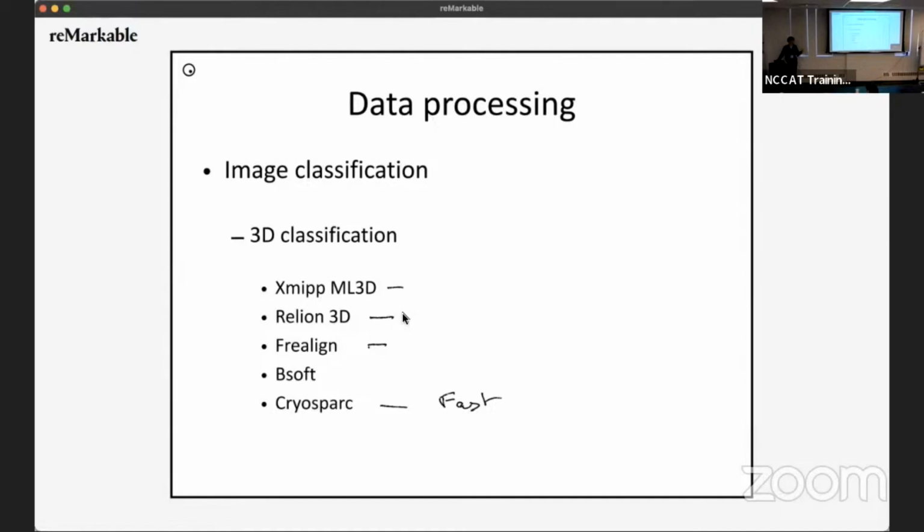One, it's very slow, so it would be expensive to do, but not impossible. But there are some quirks in the Relion statistics, basically the statistical framework, which make it break down when you have references that are not basically all the same.